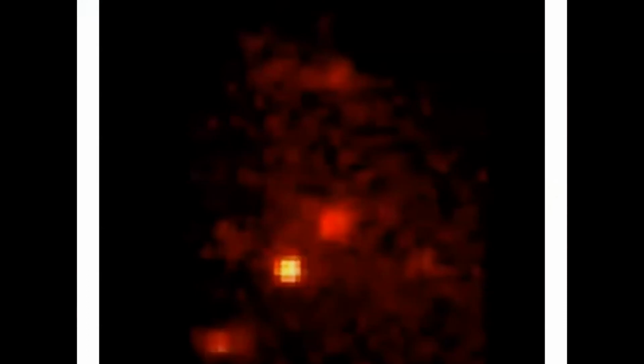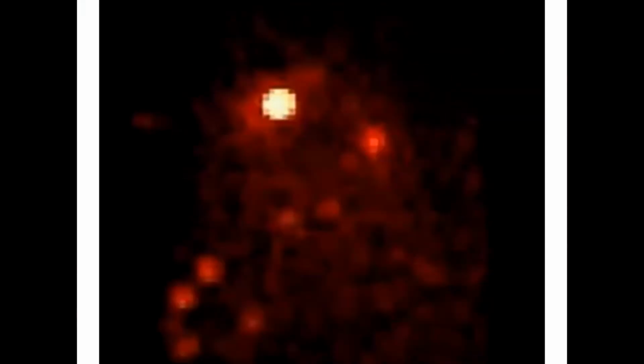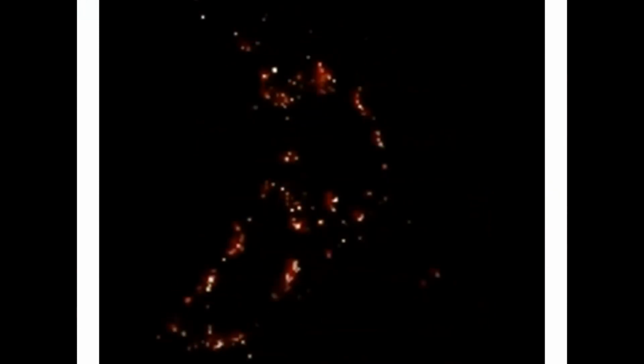Okay, so this is going to be a movie of what's happening. You're going to look at a sample. I think it's a cell. And you're going to see this kind of flashing of lights, which are the individual dyes that are fluorescing, but stochastically. Right? So you see all kinds of blinking spots of light, and each blink will allow the algorithm to fit the exact position of the dye. And we put that on top of the image.